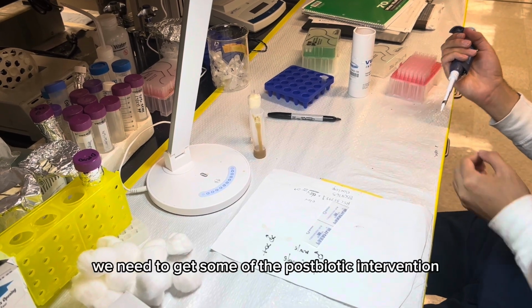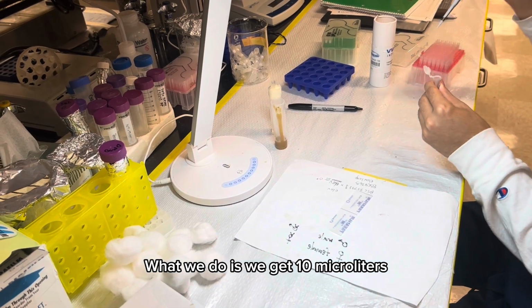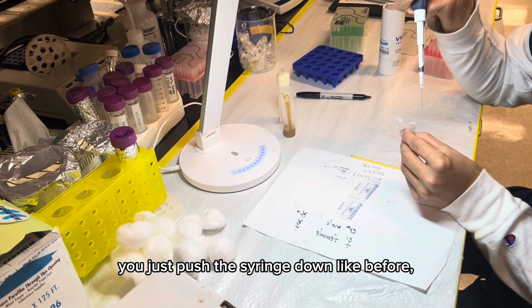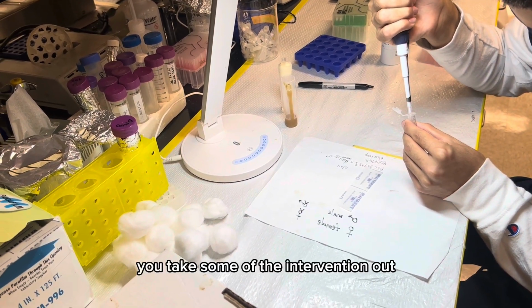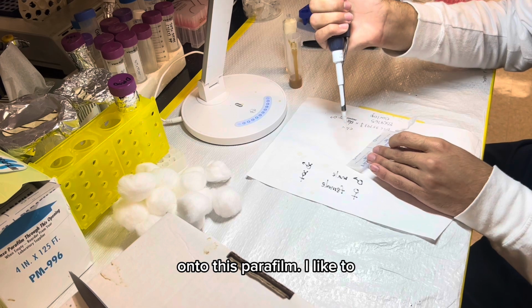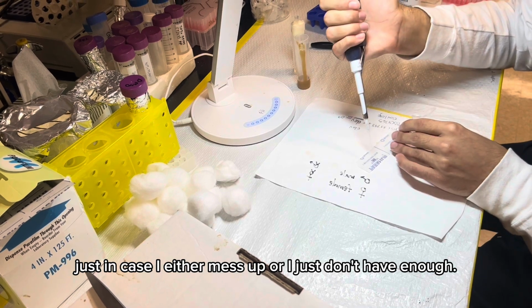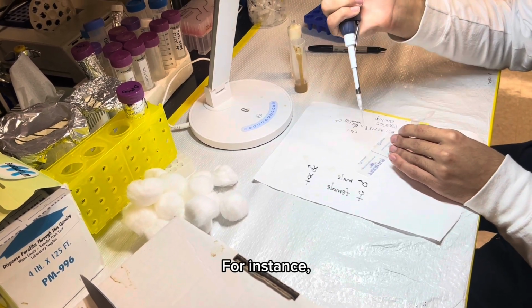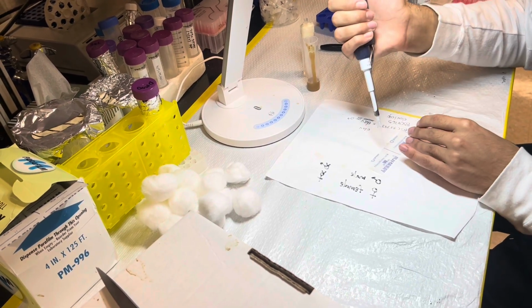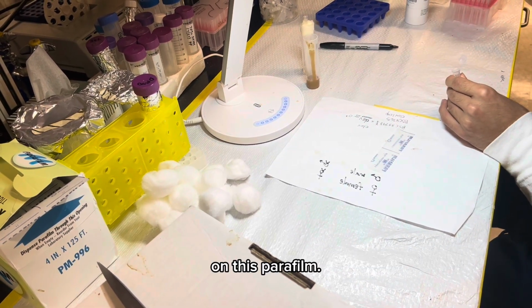To actually feed the flies, we need to get some of the postbiotic intervention onto this little parafilm that I cut here. So what we do is we get 10 microliters into this syringe. I have it calibrated here. You just push the syringe down like before. You take some of the intervention out, and you just get some little droplets onto this parafilm. I like to sometimes do extra, just in case I either mess up or I just don't have enough. So for instance, since I need 2 droplets, I'm actually gonna do 3. And here you have 10 microliter droplets of the postbiotic intervention onto this parafilm.